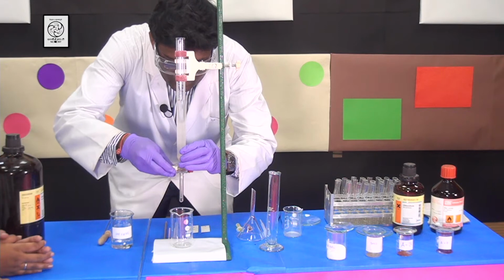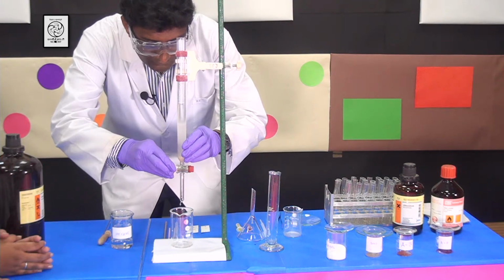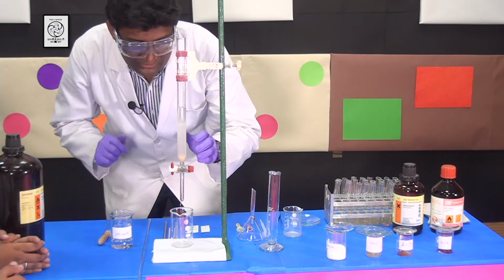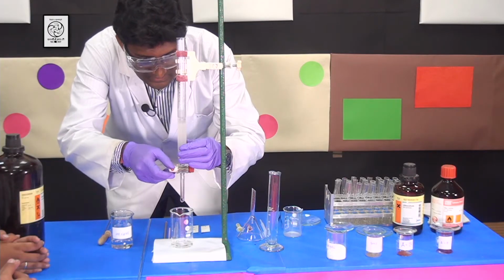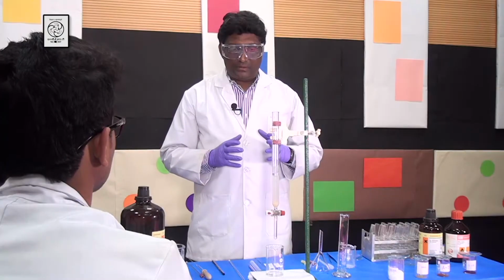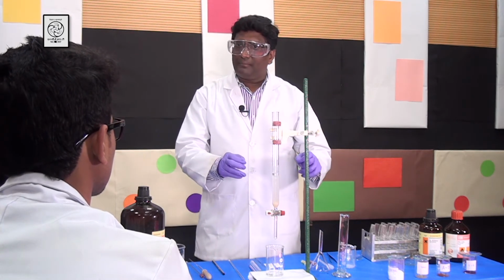So now I am going to release the stopcock very gently so that the extra solvent which is on the top is going to come down slowly. Then the silica gel is settled down nicely. There is some solvent on the top of the silica gel. Make about 3 to 4 inches height of silica gel so that the compounds can be separated properly.